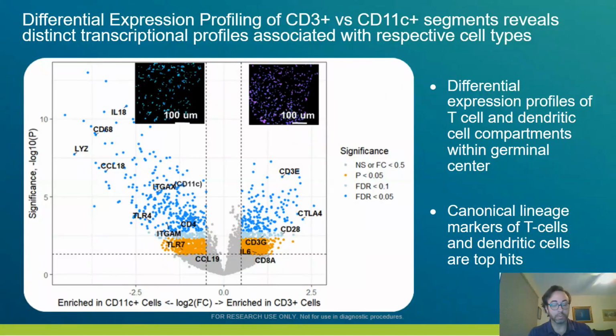It was actually discovered really within the lymph node and has played a huge role in terms of both immune cell development, as well as overexpression of that particular marker is a target now in cancer therapeutics and immunomodulation within autoimmune disease as well. We're able to directly detect this within a single sample of this tissue.